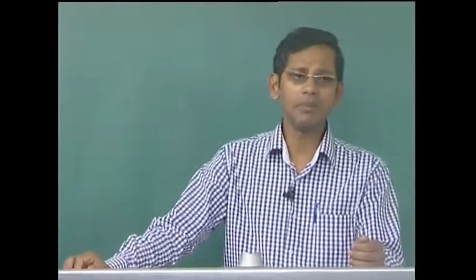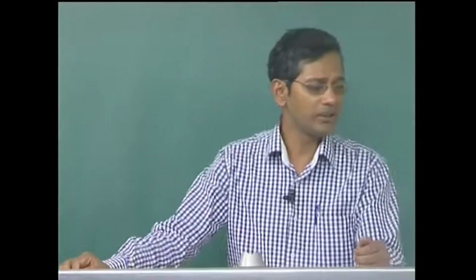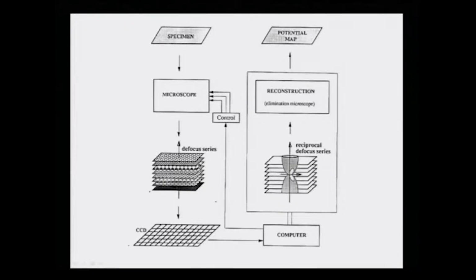This can be done using a technique called the multi-slice method. In this method, the specimen is sliced into many small slices, taken normal to the incident electron beam.